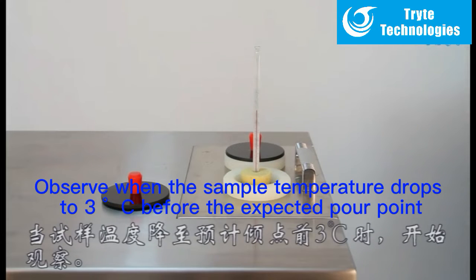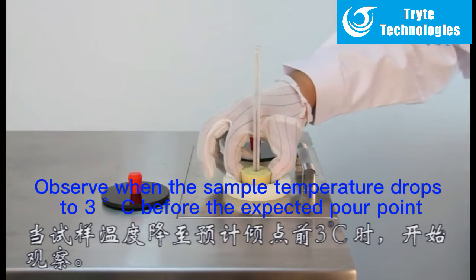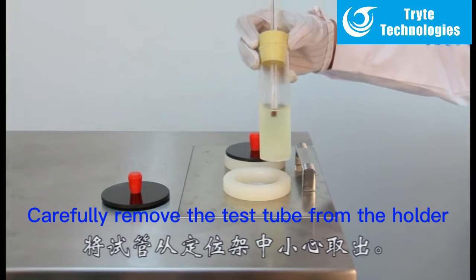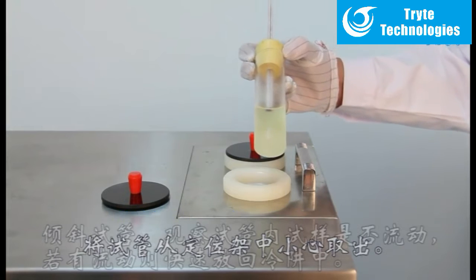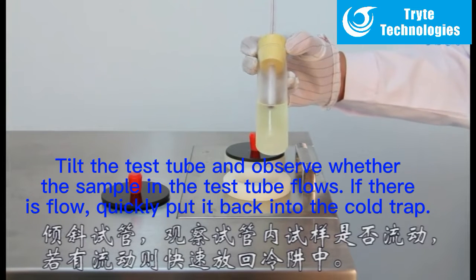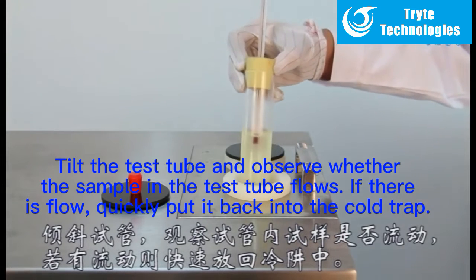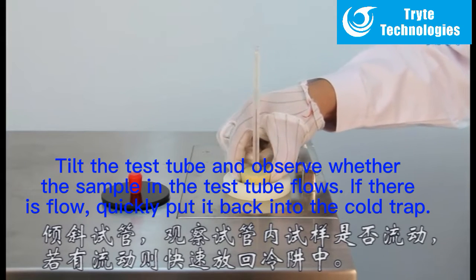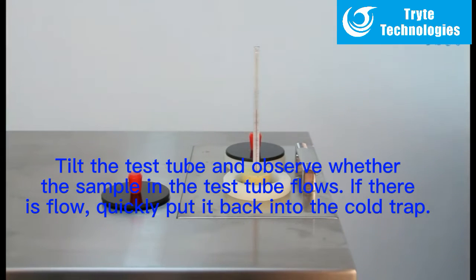Observe when the sample temperature drops to 3 degrees Celsius before the expected pour point. Carefully remove the test tube from the holder. Tilt the test tube and observe whether the sample in the test tube flows. If there is flow, quickly put it back into the cold trap.